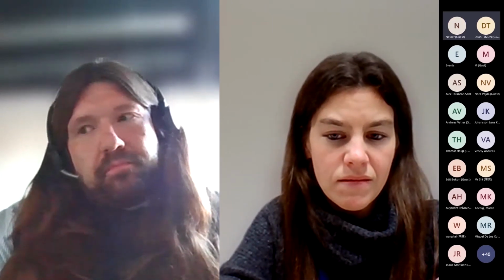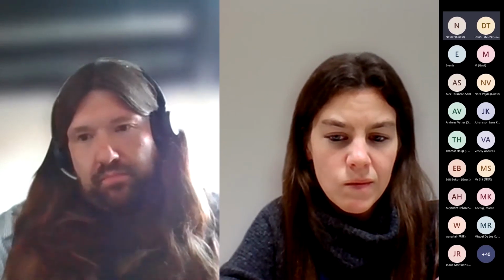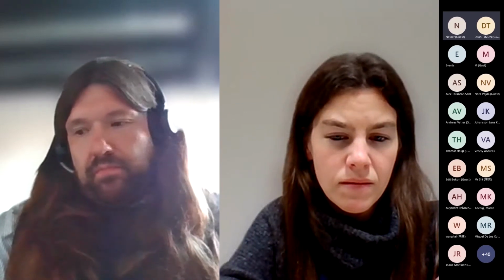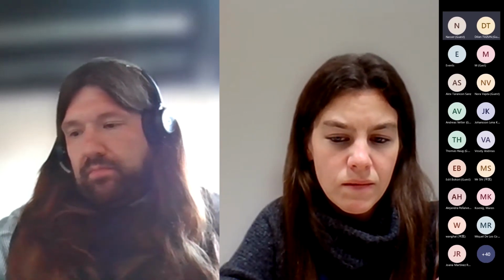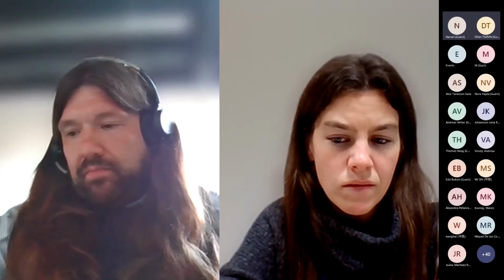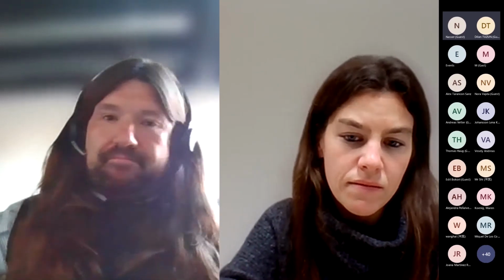Yeah. I think we used to measure iodine-129 by radiochemical separation for Sellafield. And they were quite happy because we were getting a very low detection limit. But after some time, they found that doing gamma spec would meet the requirement for free release. So it's a decision to be made by the community.